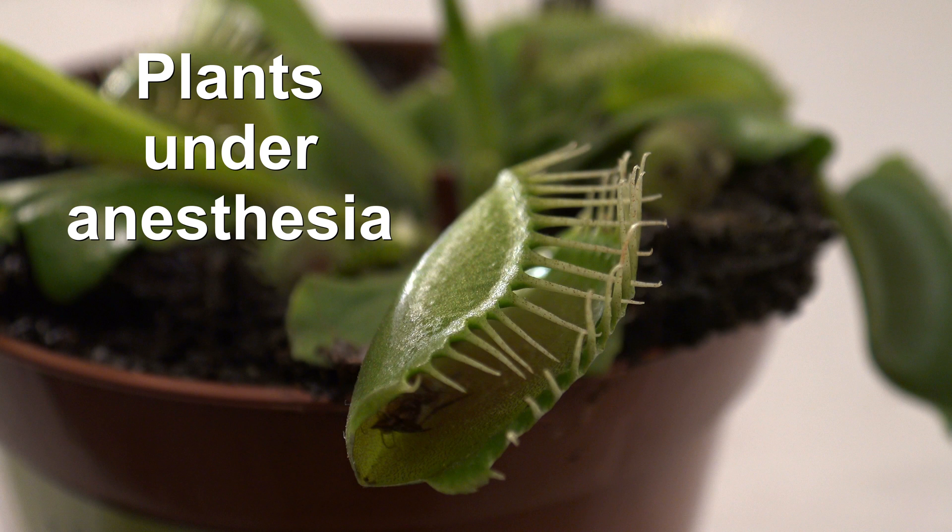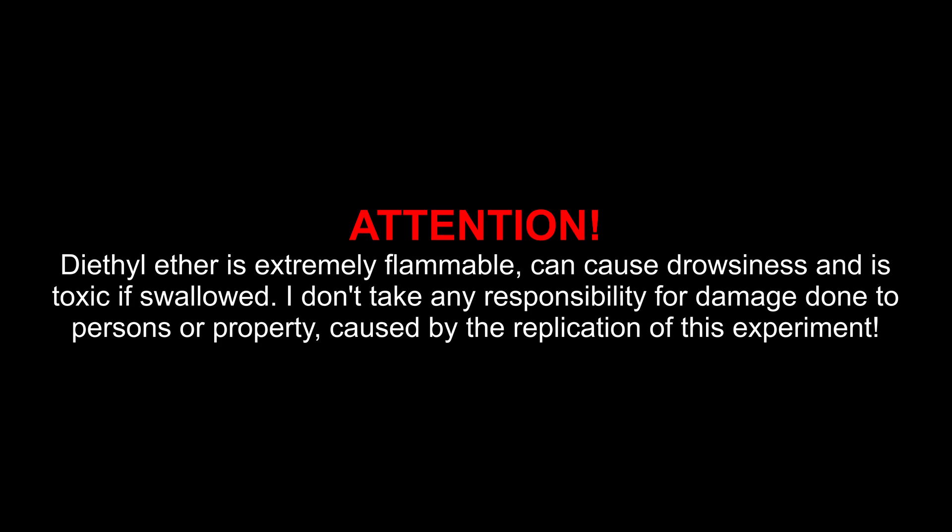Plants under anesthesia. Attention! Diethyl ether is extremely flammable, can cause drowsiness, and is toxic if swallowed. I don't take any responsibility for damage done to persons or property caused by the replication of this experiment.